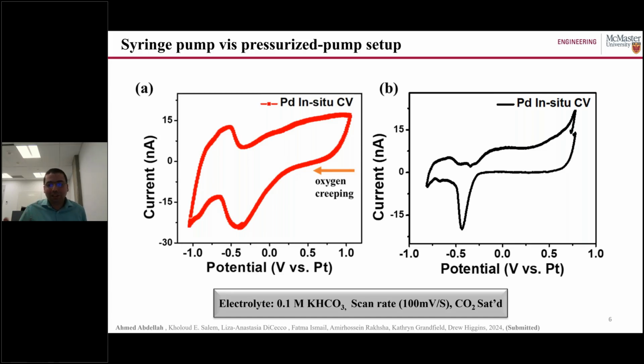When we use the pressurized pump, as you can see here in the reduction peak on the right side, it is very sharp, and you are conducting in the same condition.